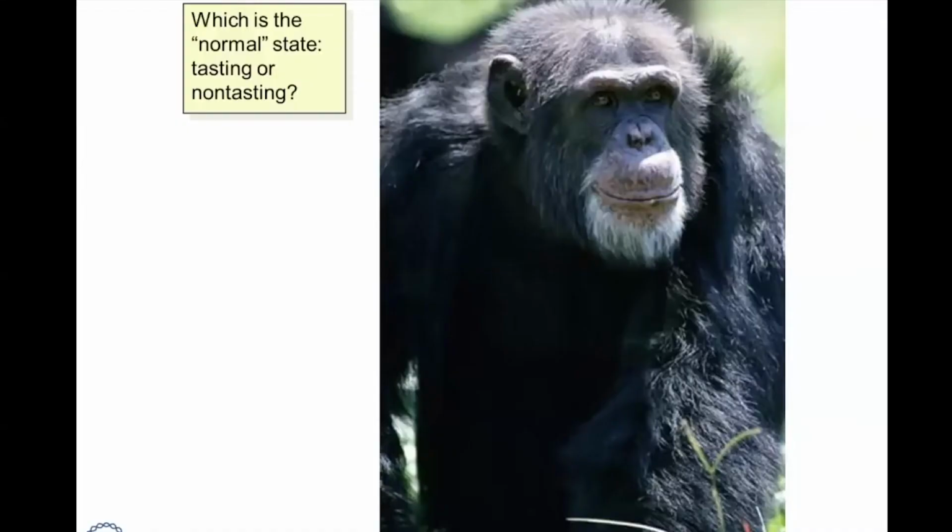All right, now let's solve the riddle. Which is the normal state, tasting or non-tasting? To solve this problem, we need to compare the sequence of the non-taster gene and taster gene with, let's say, a gorilla's taster gene and the chimpanzee's, those kinds of primates' taster gene sequences, and see which one is more consistent here. Therefore, it gives us a sense of which one is more original, more normal. Okay, I'm going to show you how to do this now.